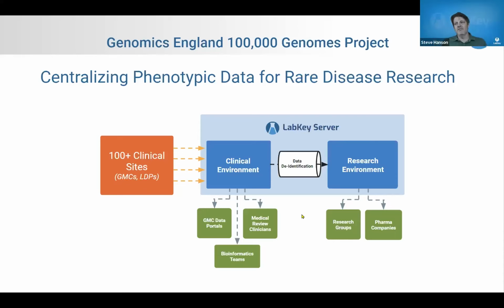They've collected data from hundreds of different clinics, done cheek swabs, analyzed those results, grabbed a whole bunch of other clinical data, put it all into LabKey Server, and built these different environments for people, including portals for the doctors, portals for the researchers, and then portals for the general public. This is a great project. It's really fun. You should Google it and look at their public-facing stuff. It's LabKey underneath it all.